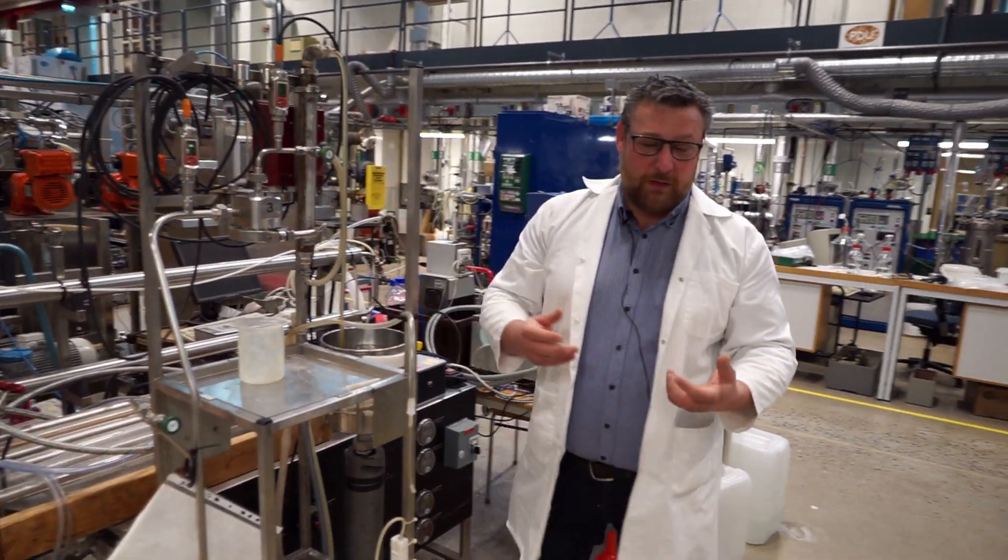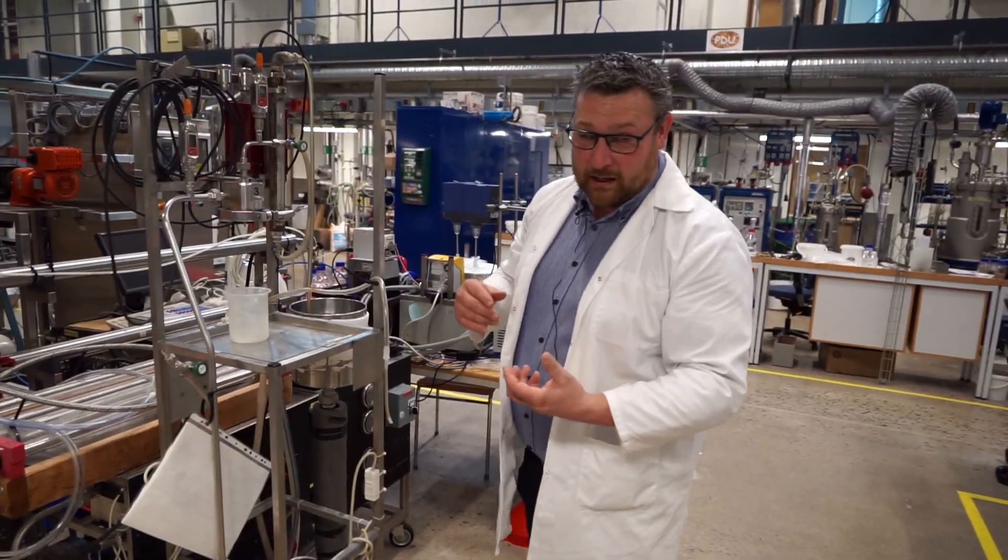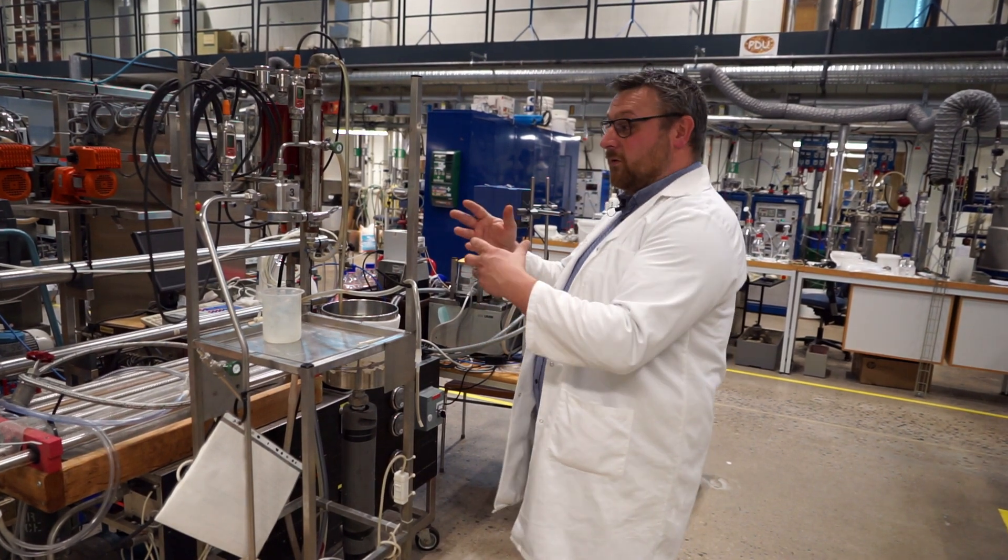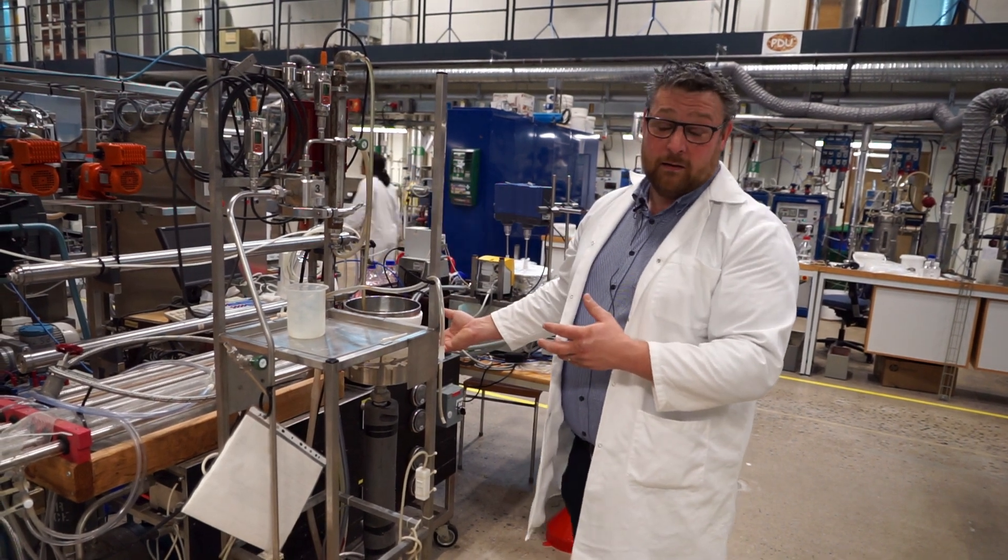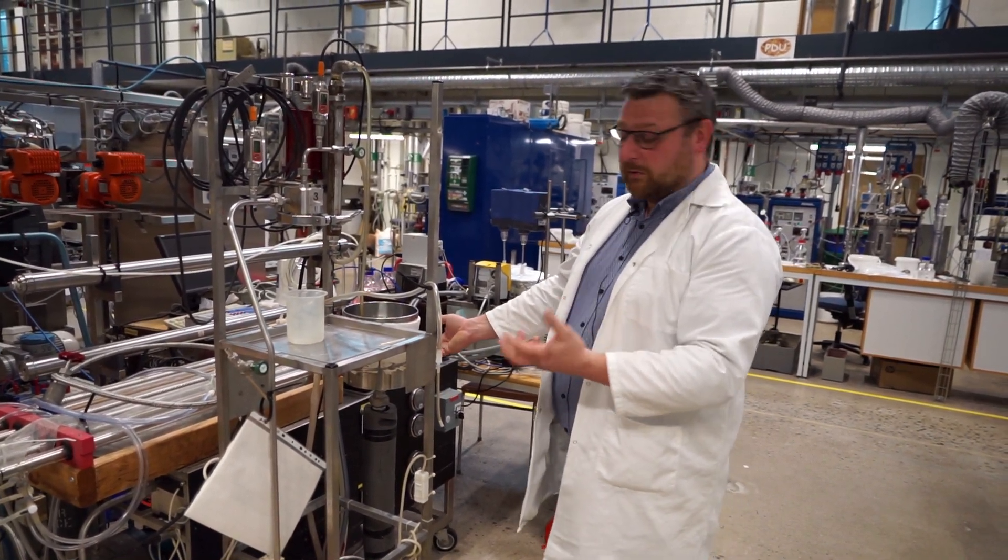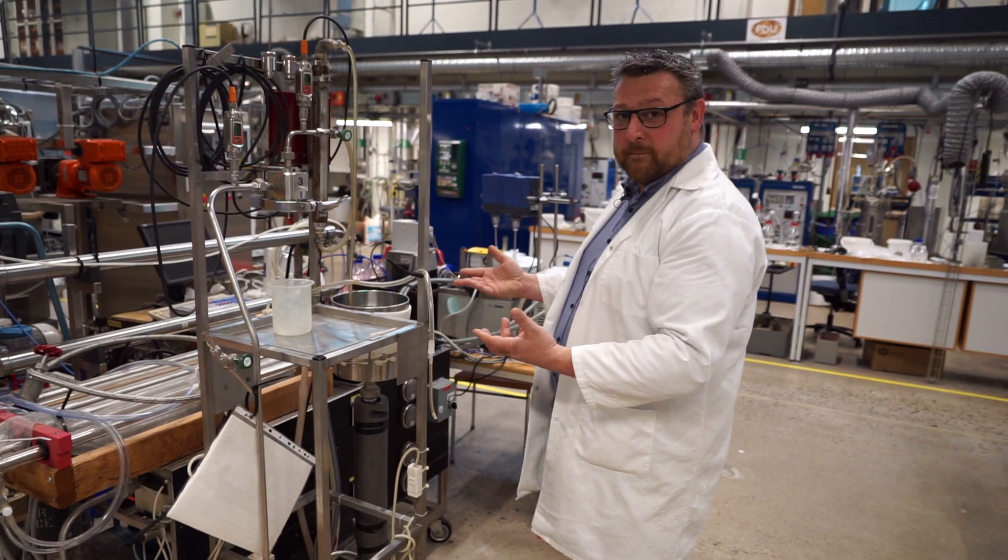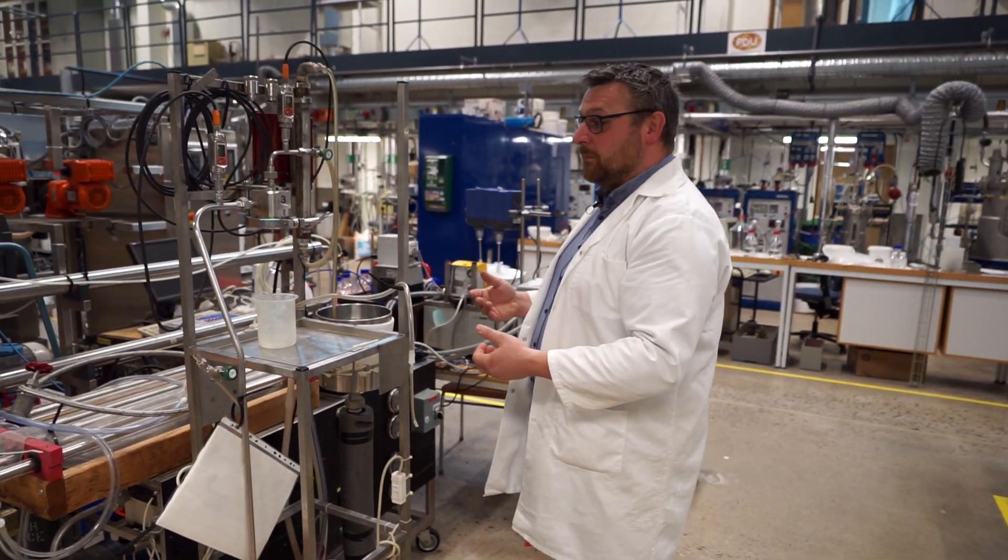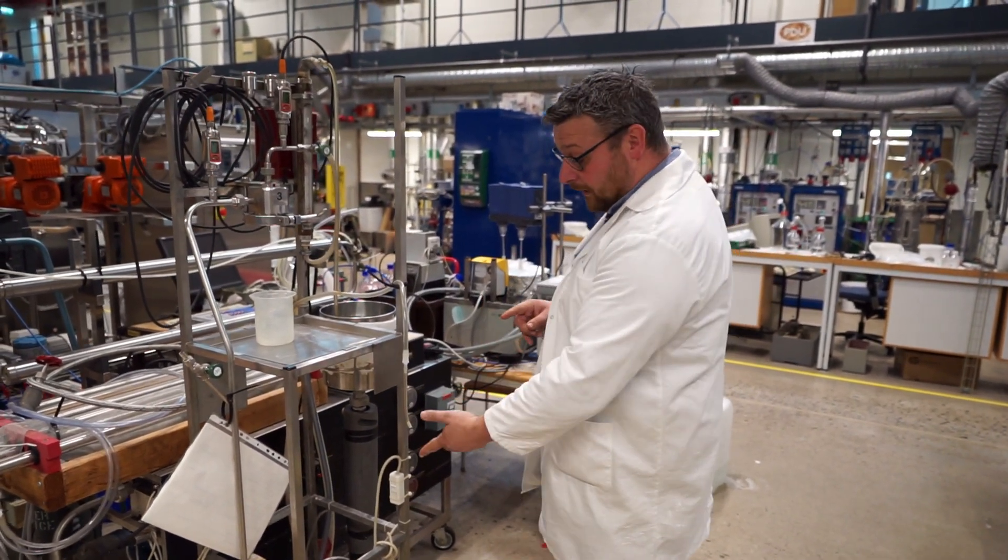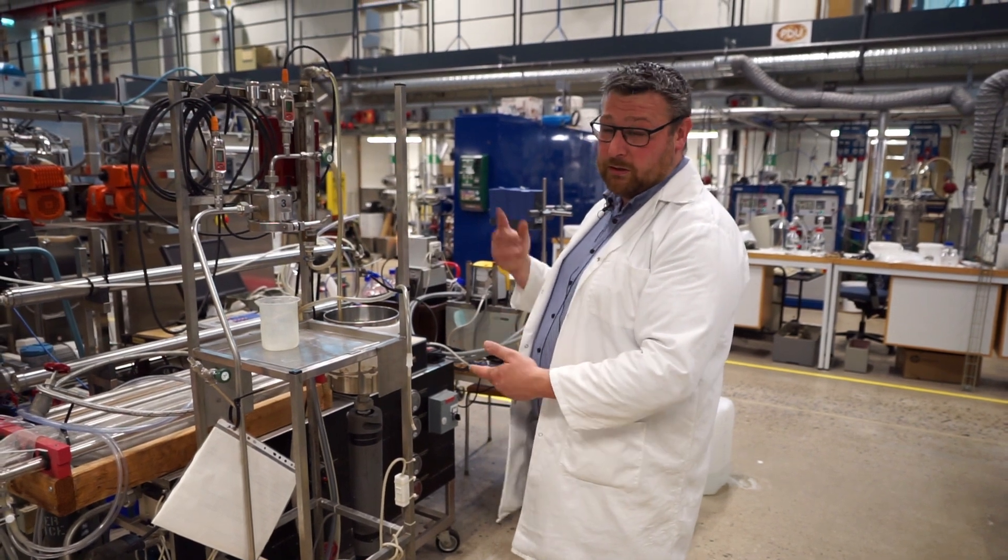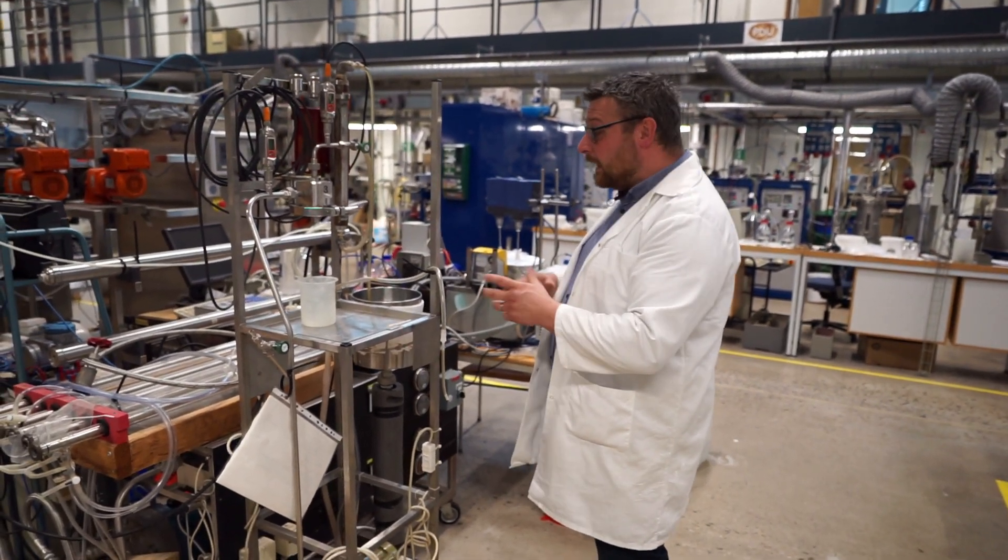The objective is, of course, to run at as high flux as possible without destroying the membrane, destroying the equipment, or destroying the things that you have in solution. Yeah. Because, since they are valuable, it can be proteins or vaccines or whatever that you want to concentrate. And the proteins might be a bit sensitive there then. And proteins might be a bit sensitive both to shear forces and to temperature. And since we have a pump there, it basically rushes energy into the system. So, we have shear forces at quite different places here. That one needs to be careful about.